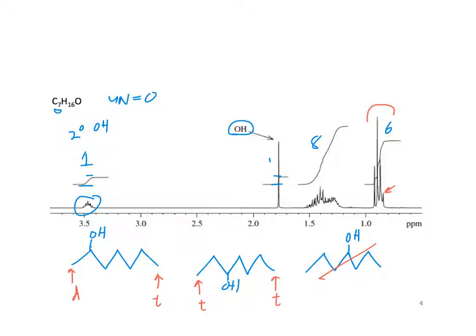I think there's two triplets overlapping, or a triplet and a doublet overlapping. It'd be the smallest doublet ever. Yeah, it'd be really tiny. I can't convince myself that that's a doublet either. I'm kind of leaning towards triplet as I look at it. Well, I would say that this little one that I pointed out on the side has to be part of probably a triplet, right?